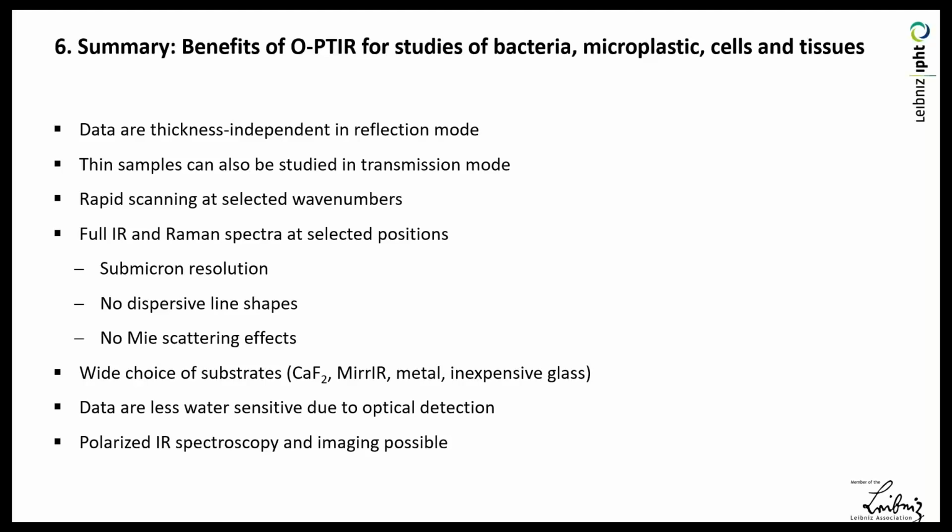Was it because the others are too different, or the others were running separate experiments, or what was the reason? Yeah, of course, we also took a look at building a model to try to separate all 6 cell lines in a single model. However, this was not very successful because of the overlap, or the spectral similarity, of the leukemia cells.